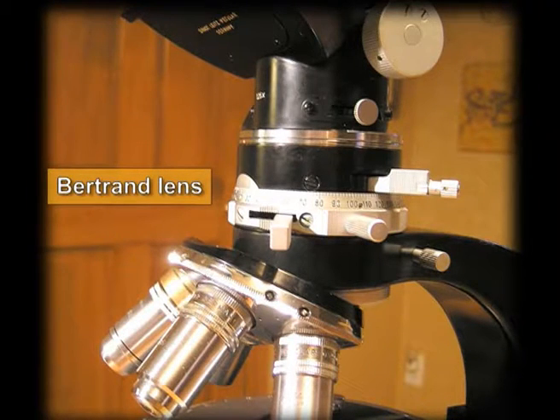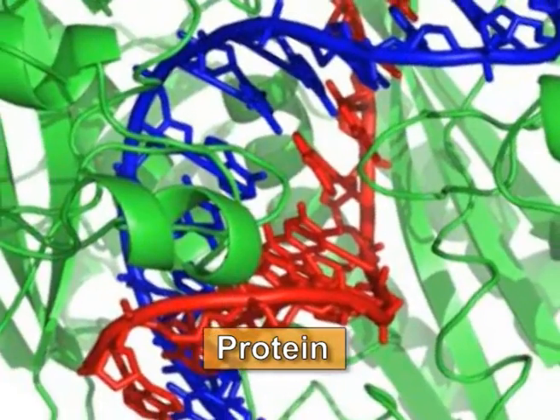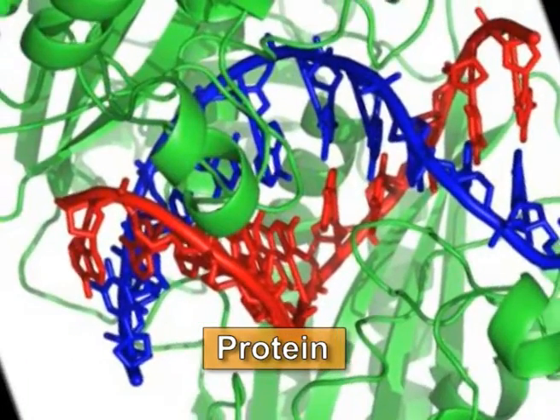Now, after light passes through such an anisotropic object, depending on the nature of anisotropy, the polarization of light will change, and this light will then pass through an analyzer, and in certain cases there can be Bertrand lenses, which are projector lenses which project such images and take them to the computer. Polarized light microscope is used to check the anisotropy present in the membrane, or even study the dynamics of different proteins in different leaflets of the membrane, and it can be used not only in biology but also in mineralogy, where it was essentially first used.